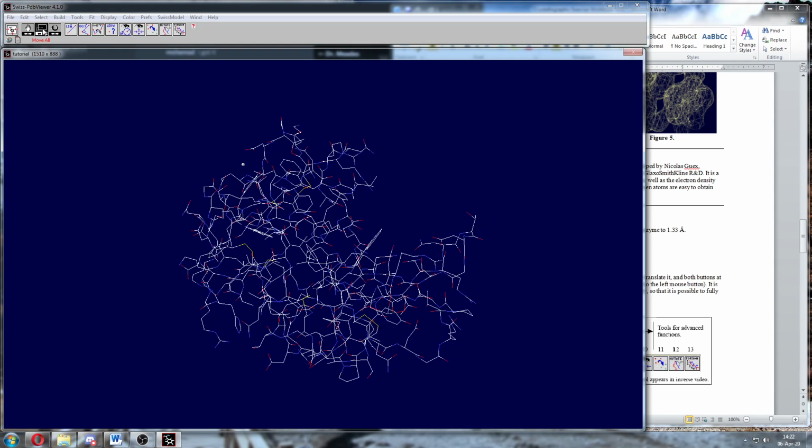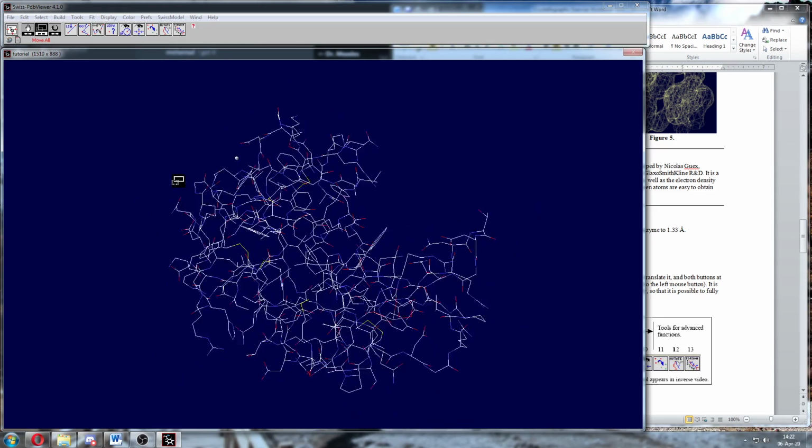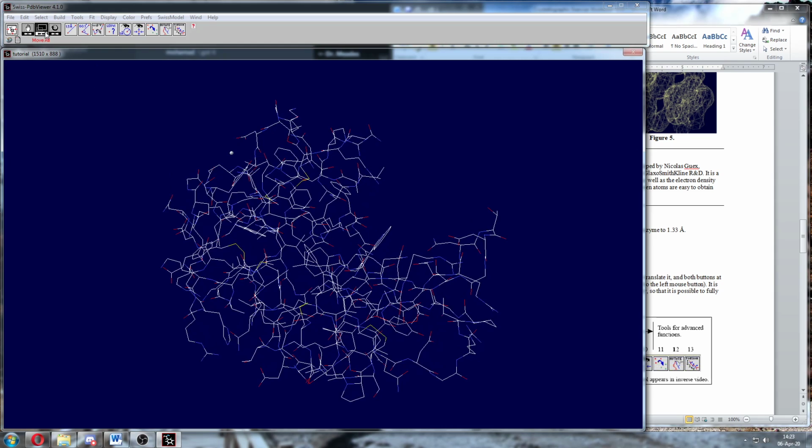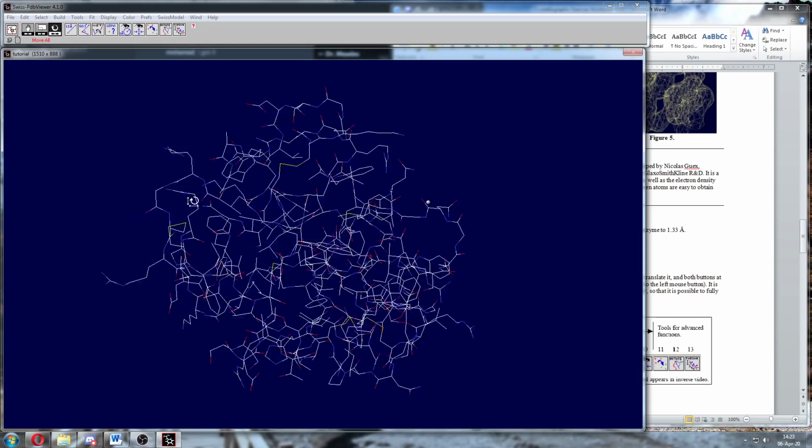If I click the second one, the window tool, and I do the same thing, I put the mouse in the field out here and hold down the left mouse button and move it, it should zoom in or out, right? Either way you want to move it. So I have a translate tool and a zoom tool. Lastly, with the arrow, if I put it in the field and click and move the mouse, it'll rotate it in the direction I'm moving.